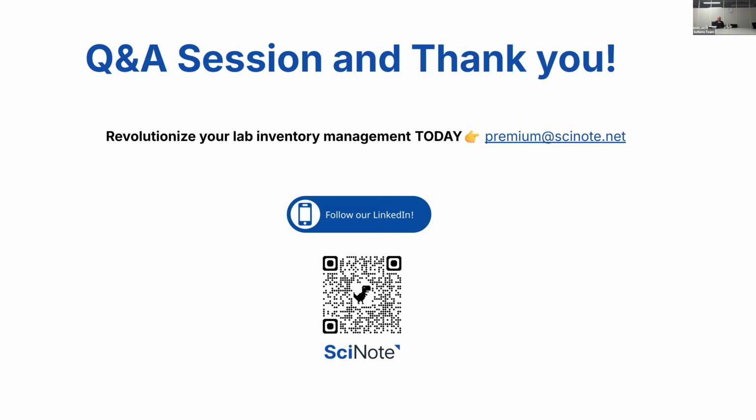Alex, another question. Label printer compatibility. Yeah, okay. So we are integrated with Fluix printer and Zebra Browser Print. There is a long list of printers supported by Zebra Browser Print, and there's a knowledge base article we can share with you. Also, if you reach out to your customer success manager, they will be able to provide you the exact information on which printers are supported, and you will be able to use them.